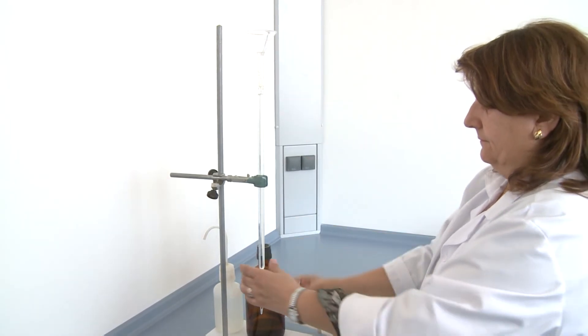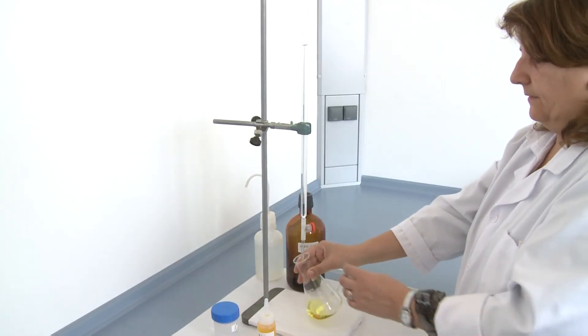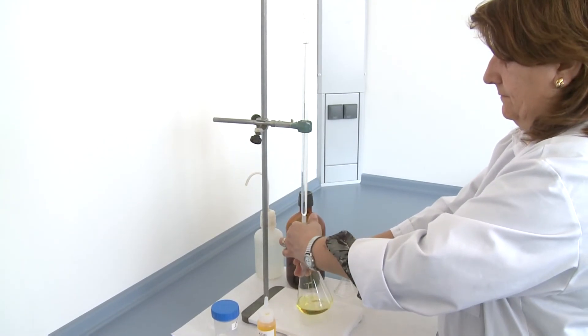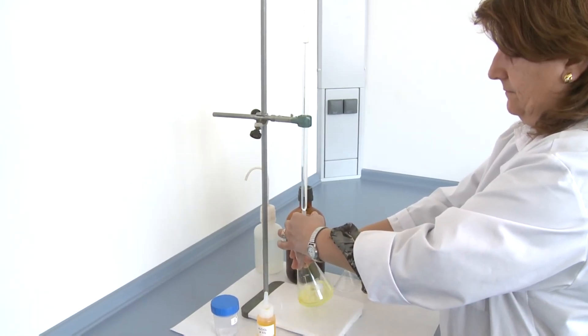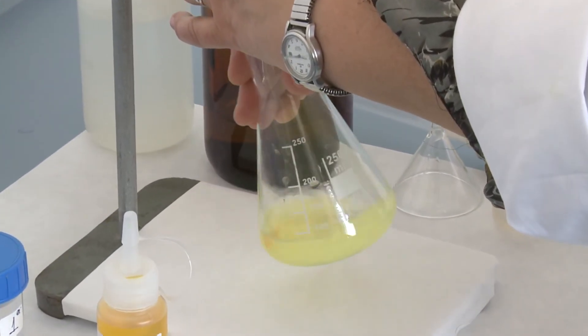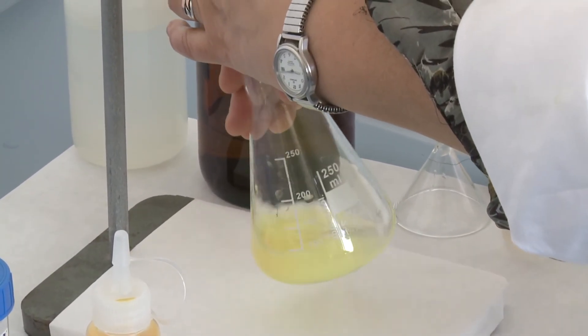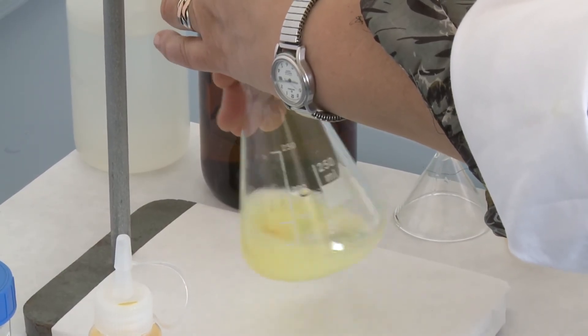Then proceed to make up to zero of the burette with silver nitrate solution. Then you start to titrate with silver nitrate in this solution drop by drop while stirring continuously the Erlenmeyer flask, until a precipitate of pinkish red appears, which indicates that it has reached the end of the assessment.